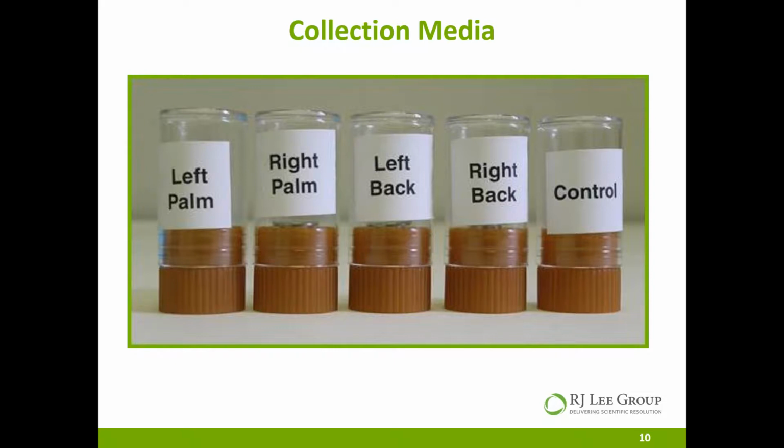if your kit has one. So while our kit has 2 stubs per hand, meaning we have a left palm and a left back, 2 stubs for the left hand, a right palm and a right back, 2 stubs for the right hand, you can most certainly use just 1 stub to cover the entire hand. So kits that just have 2 stubs in it, a right hand and a left hand, are totally fine to use. So while most kits do separate between hands, right hand and left hand, that really holds no specific significance to me as the analyst.